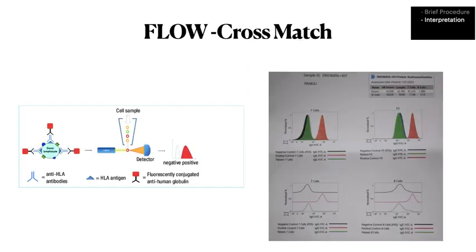So I'll show you examples here. In this picture, the black one is a negative control, and again a black one here. You can barely see it next to the green one. The green one is a patient sample. So you can see the patient sample is overlapping the black one, both in T and B cells. Because they are close to the black one, they are negative. So this is pictorial. Again, there are numbers for it also.